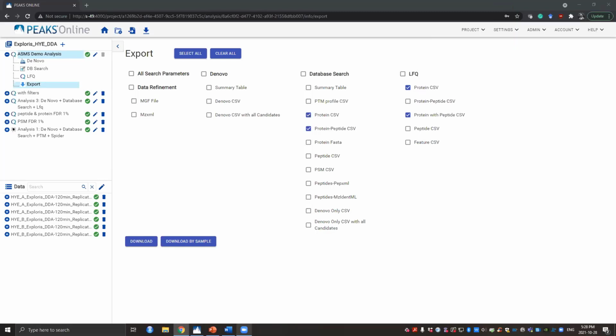And if not, feel free to interrupt me if you do have an answer to that. But technically speaking, you can get all the information that's provided in PTM profiling out of the Peaks result tables, because the PTM profiling results are basically just a subset of the label-free quantification results.